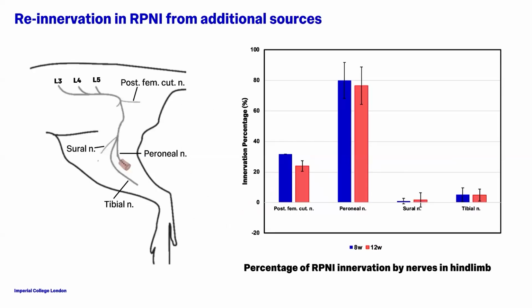So we were curious about the level of reinnervation in this specific model for potential spatial selectivity from this construct in a kind of biohybrid interface. What we found was that the reinnervation of that muscle tissue doesn't come solely from the nerve that we use to embed it. That is to say, our construct doesn't get one source of reinnervation. There's enough tissue regrowth going on that we seem to be getting innervation from other sources.